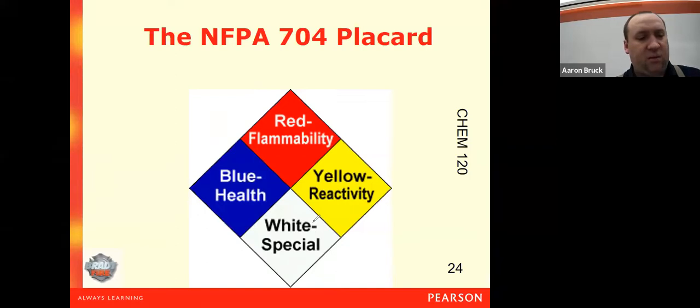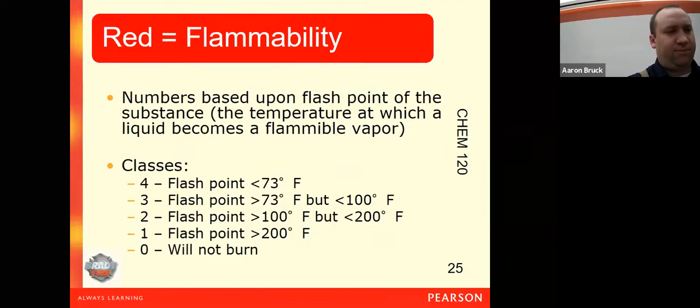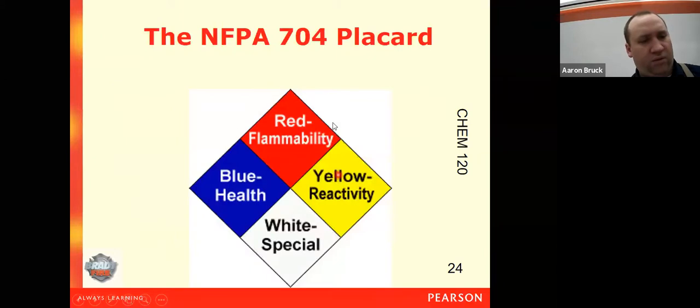So you can see that here we have a blue diamond, which indicates health. We have a red diamond here to indicate flammability danger. You have a yellow diamond here to indicate reactivity. And then we have a white diamond here that indicates any other kinds of special hazards.